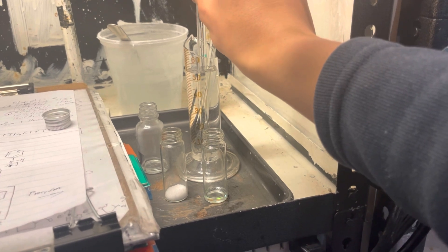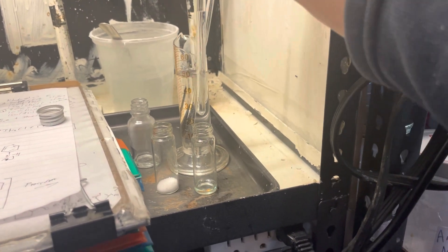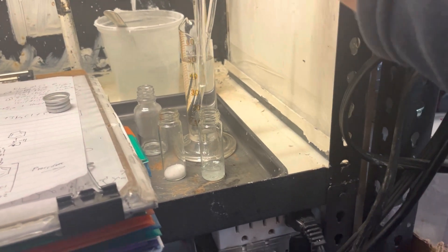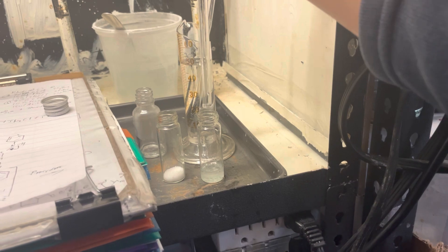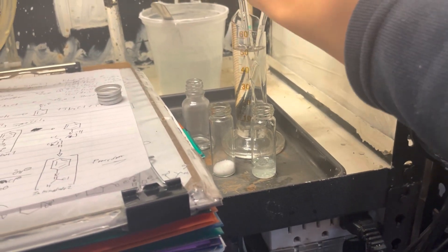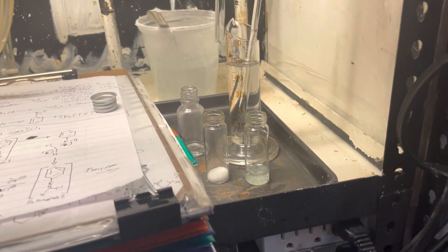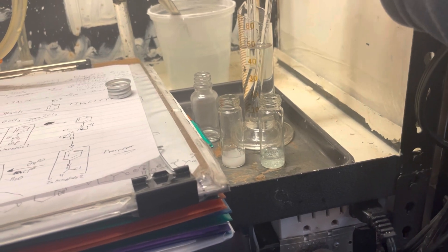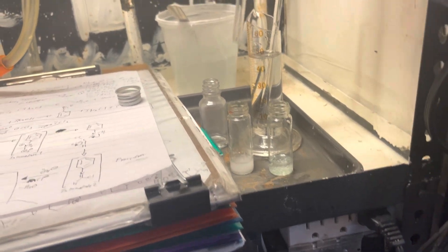So I'm just gonna dissolve each of these things in an ethanol solution. The reaction we're performing is known as isonitrile synthesis, or Hoffman isonitrile synthesis, where through the magic of chloroform and sodium hydroxide, we can turn an amine into an isonitrile.